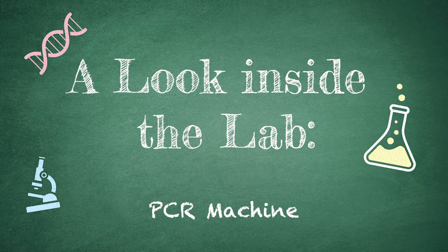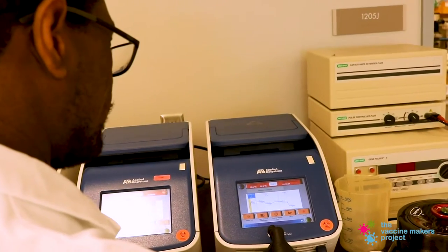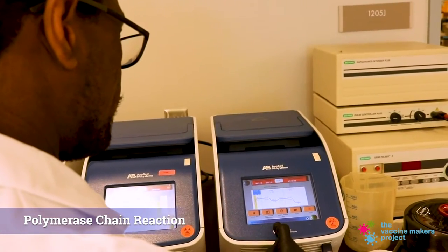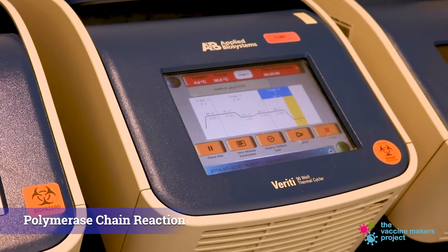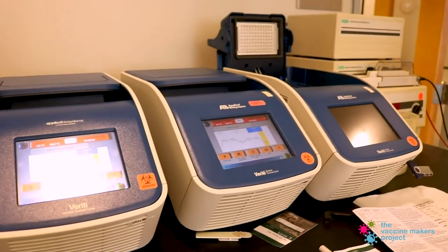A PCR machine is called polymerase chain reaction, so it uses a DNA polymerase to amplify a target subsection of DNA into multiple copies.